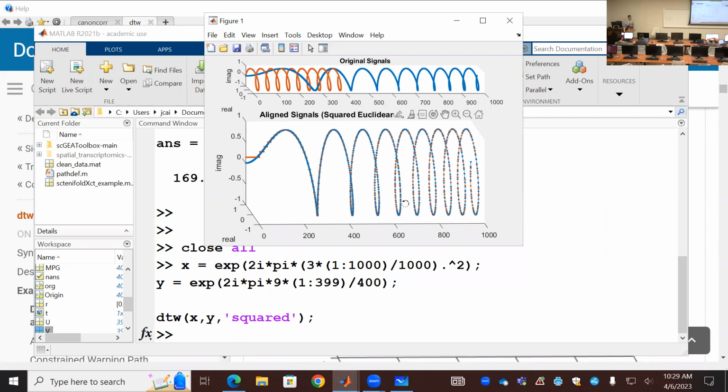I think you can just use these small examples to get some idea, and maybe sometime later when you have a problem, you know, okay, there's a way you can align this theoretical or some kind of structure in there.